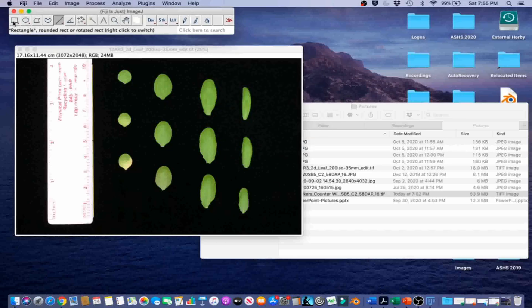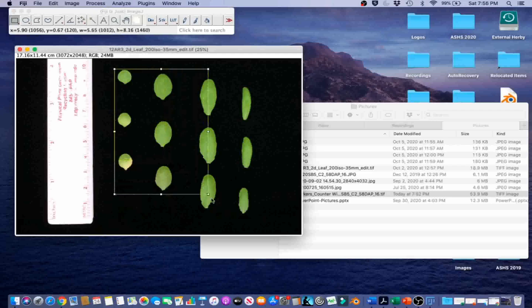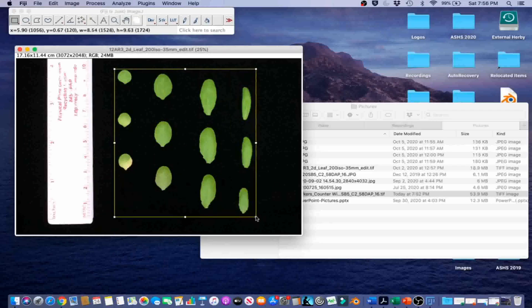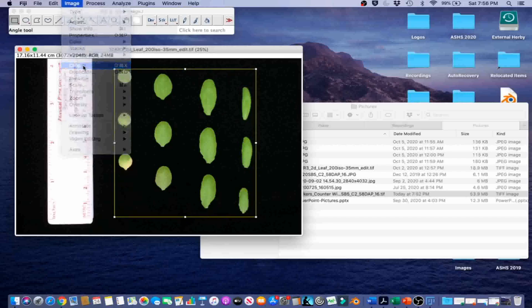Go ahead and click on the rectangle tool and select the smallest rectangle around the leaves. Then we are going to go to Image and Crop.